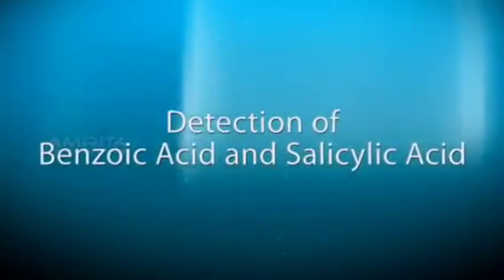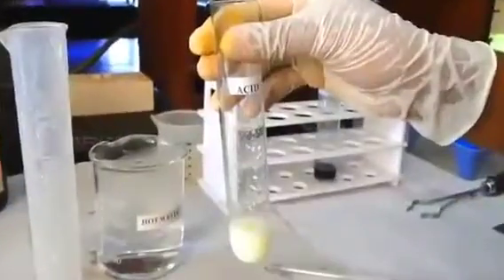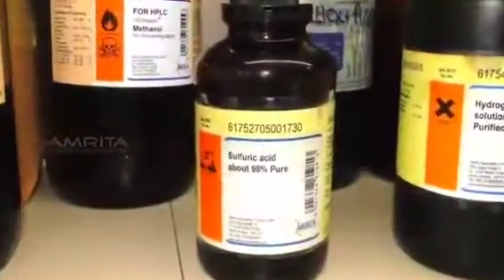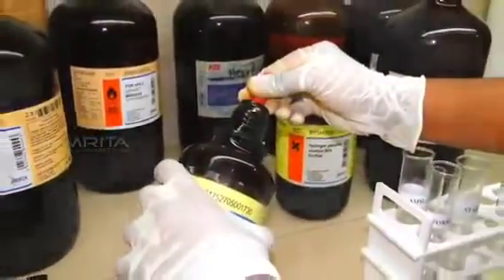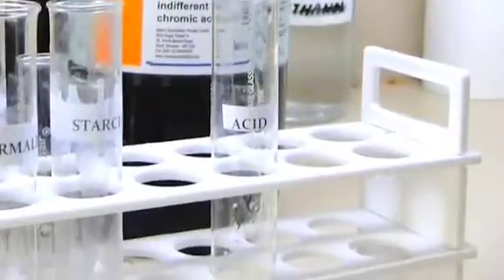Detection of benzoic acid and salicylic acid. Pour 5 ml milk from the beaker into the test tube labeled acid. Add few drops of concentrated sulfuric acid into the milk and shake the test tube gently. This should be done in the fume hood. You will observe that the milk is getting precipitated.